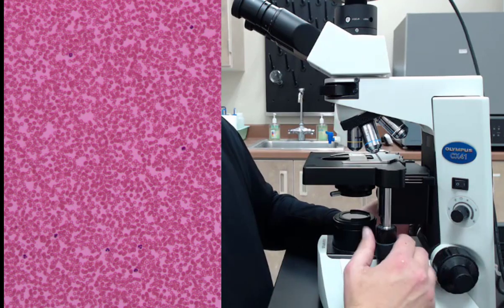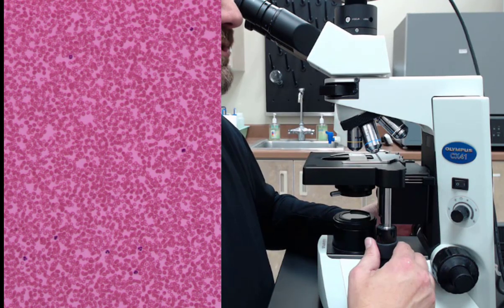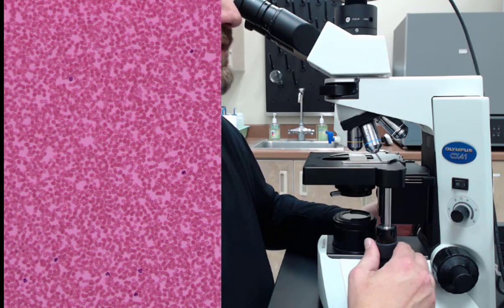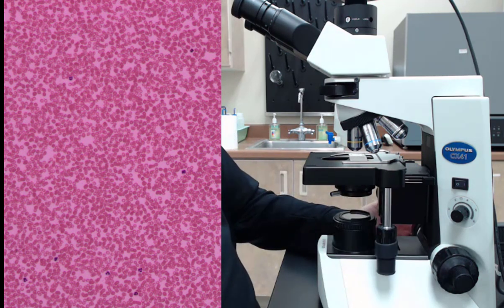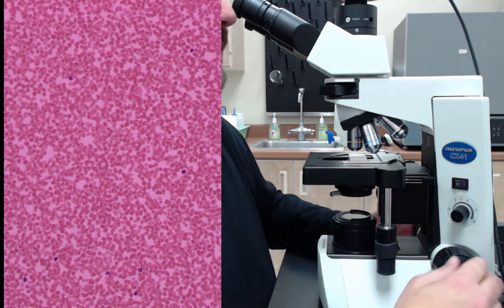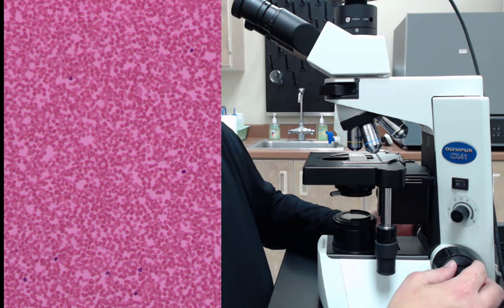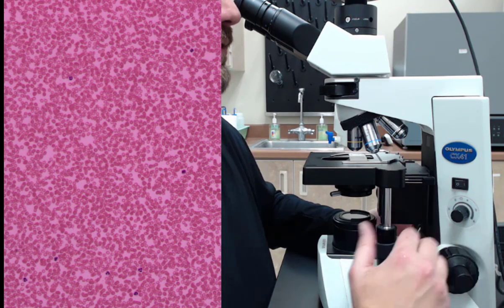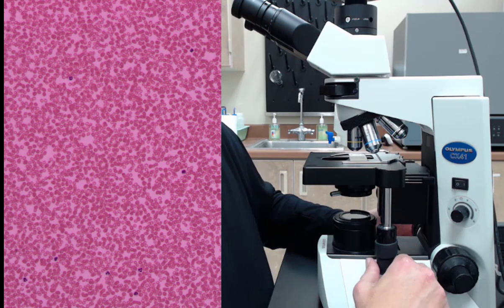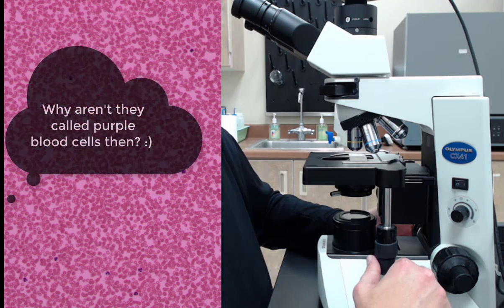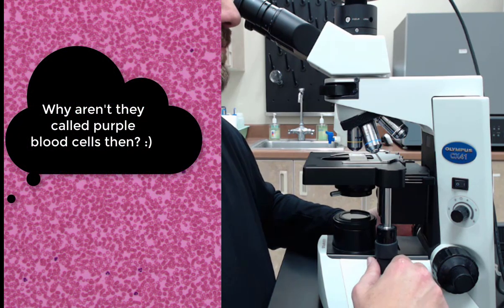All right. So the low power I now had in focus, we're not really looking at anything yet. We're just getting to the point where we can visualize structures. But what you are looking at here, your blood is 99.9% red blood cells. So you're looking at a sea of red blood cells here. Those little purple structures you see throughout, those are going to be your white blood cells. But we'll see them in more detail as we progress.